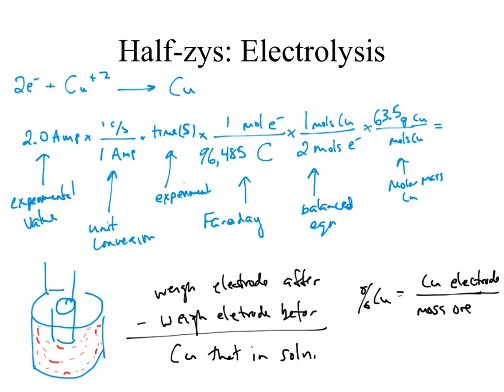Questions about your electrolysis? Why did we do that whole amperage calculation? That doesn't tell us the weight of the copper. Our copper here is in black. Why do the stuff in blue? But why do we need to convert? We get our answer without doing anything in blue.